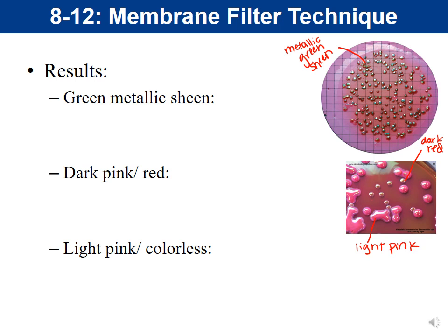Now, next part, the colonies darkened. They're not light in color. So what that tells us is that acetaldehyde was produced and it reacted with the sodium sulfite to cause the colonies to darken. The way that we get acetaldehyde is if the lactose was fermented. So that tells us that the lactose was fermented.